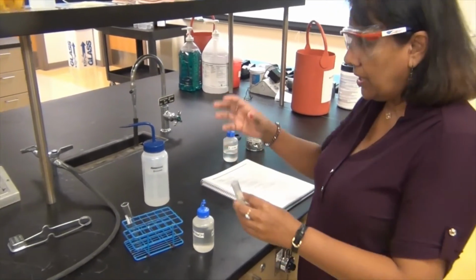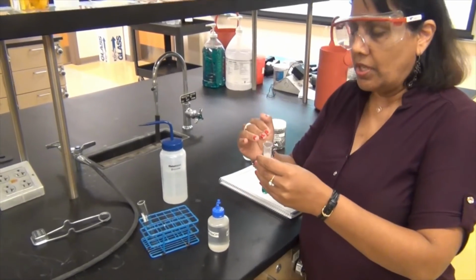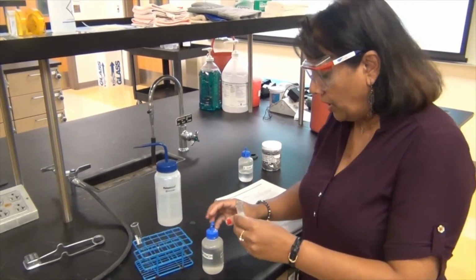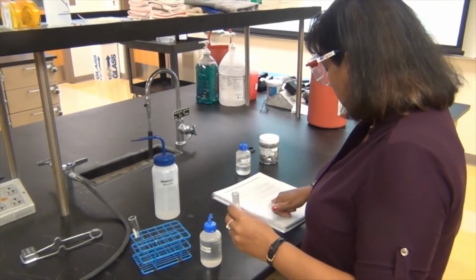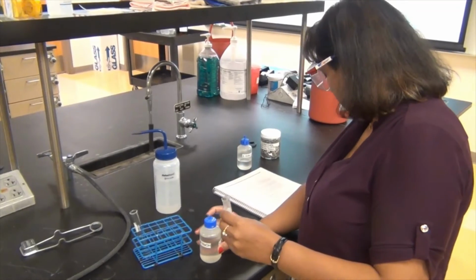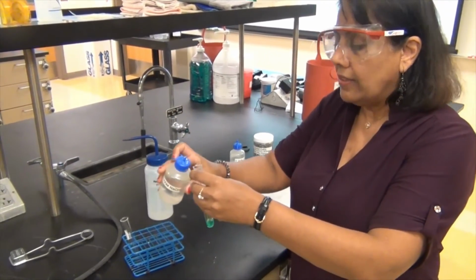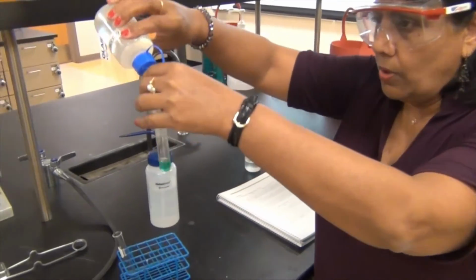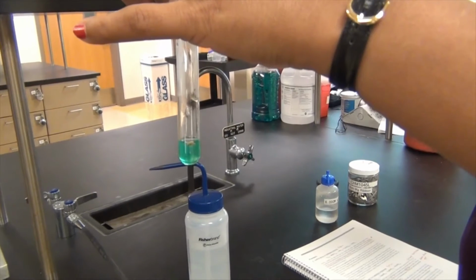Now in this case, I'm going to keep adding until we see the change and until we stop seeing the change, okay? So that's the whole point for this part here. So in the reaction scheme, when you add the sodium hydroxide, you should get copper hydroxide, which in the equation also says it's a solid, so that's what we're looking for. This one I'll go step by step, okay? So make sure you observe carefully what's going on.